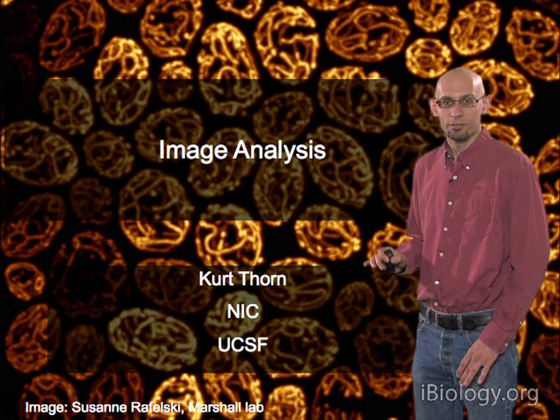So why do you want to do this? There's many reasons you might want to do it. You might want to generate a blurry image of your cells or of your data just to smooth out small little artifacts, or to just estimate what the mean brightness of something is, not dominated by small things. But one very interesting reason is because if your image is sampled appropriately at what's called the Nyquist limit, and the camera lecture talks about this, the point spread function of your microscope, so the minimum resolvable element in your microscope, will be spread out over many pixels. And that means that the information in adjacent pixels is correlated with each other, and they're not completely independent. And there's some redundancy there.